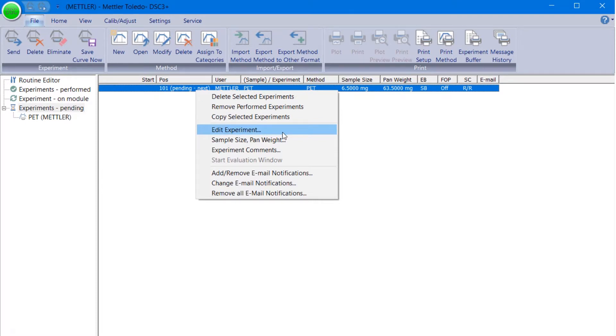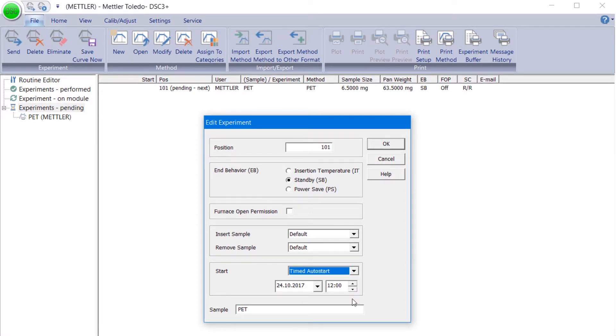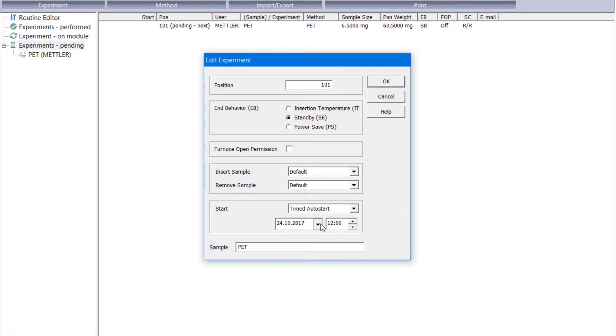Next, open Edit Experiment and select the Timed Auto Start option in the START box. Timed Auto Start allows you to schedule the start date and time. Simply use the arrow buttons to open the calendar and choose your preferred date and time.